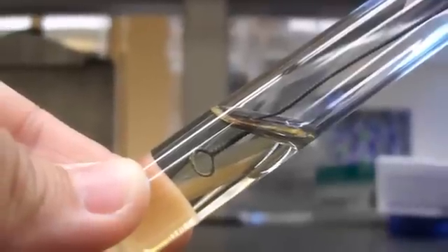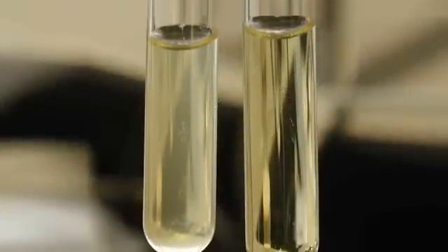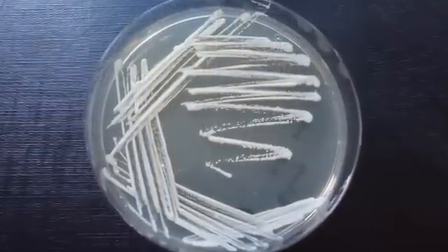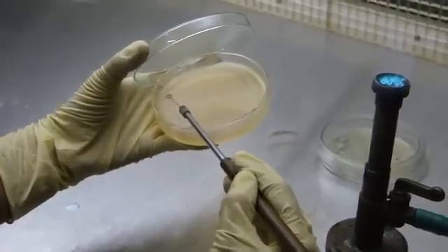Dip the loop into a sample containing a mixture of bacteria. Depending on the sample, the loop may pick up hundreds or thousands of bacteria, which are spread back and forth across the surface of the agar.